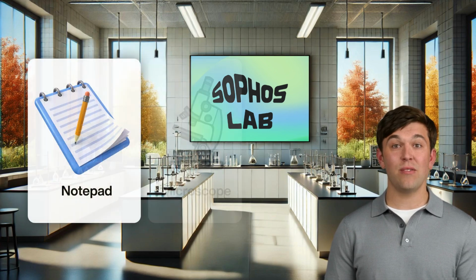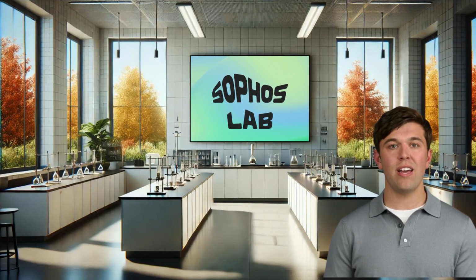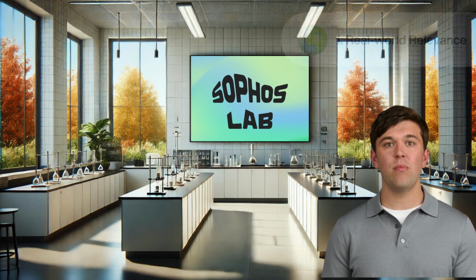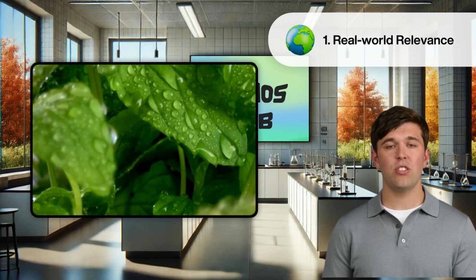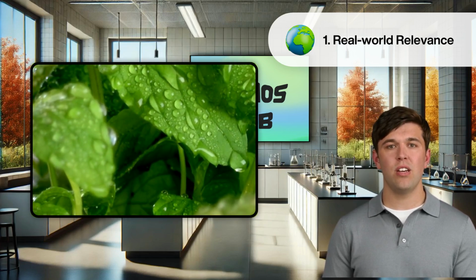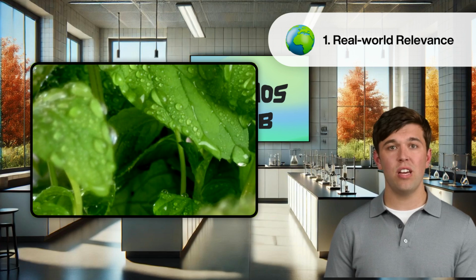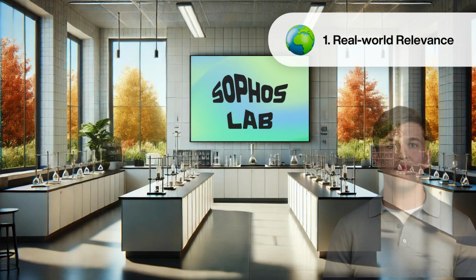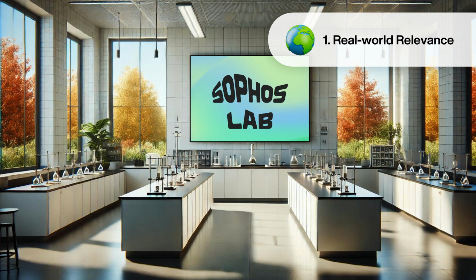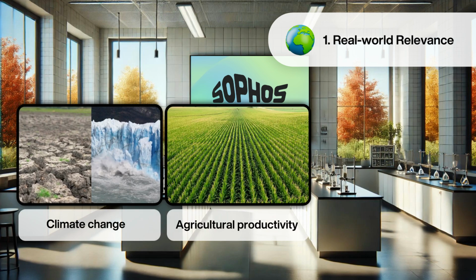Ready your notepads, microscopes, and measuring tools. Let the experiment begin. Before outlining the practical, let's take a moment to consider its importance. This practical experiment allows you to directly observe the process of photosynthesis, which is fundamental to all life on Earth. By investigating how light intensity affects the rate of photosynthesis in plants, you are studying the same processes that sustain global ecosystems. This knowledge is crucial for understanding broader environmental issues such as climate change, agricultural productivity, and ecosystem health.